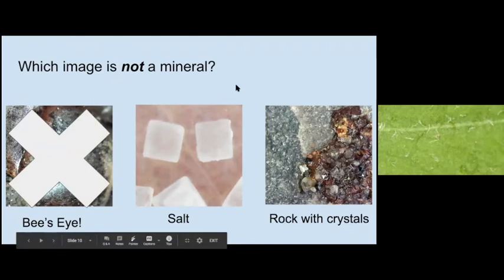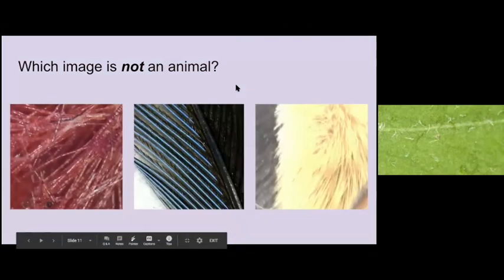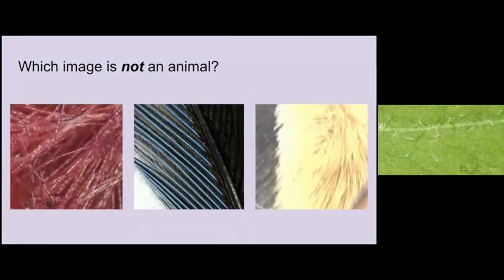Let's do another one, this time trying to figure out which one is not an animal. And you guys are pretty good at this, so this one's pretty tricky. So let's hear some observations.